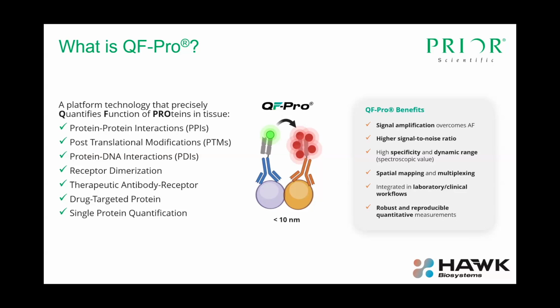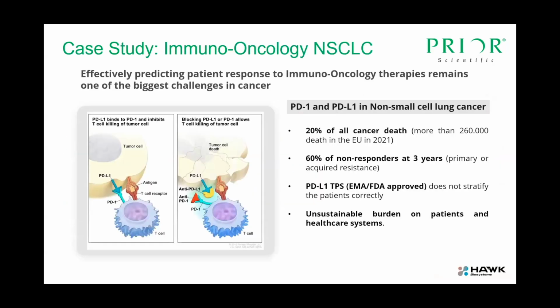So what that was really meaning for them initially was that they were working with conventional microscopes, but conventional microscopes come in different shapes and sizes. They come with different software to do different things. And what that can mean in a clinical environment is there's too much for people to learn, and they wanted to develop an instrument that could do something more specific.